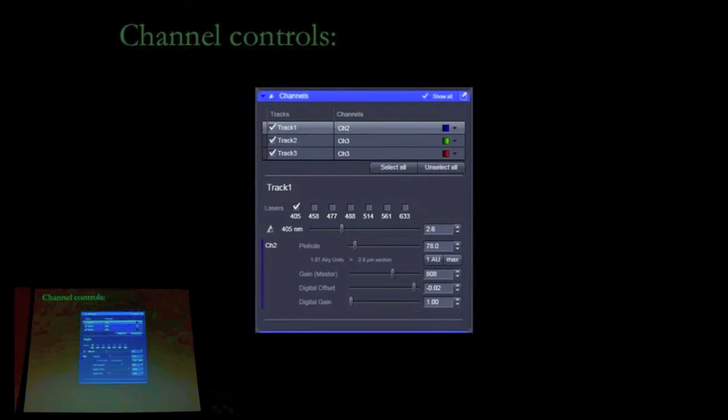So Andrew, can you briefly talk about where you should set your gain? Yeah, the answer is in the middle, but I'll talk about why it's the middle. That's right. But my point was that there should be a balance of how much light you put into the system, matched to your fluorophore, and then how much you crank up the gain to get a good signal versus getting super pixely and noisy. Yeah. So I'm going to leave those discussions for Jesse. He's got a lot to say on that.